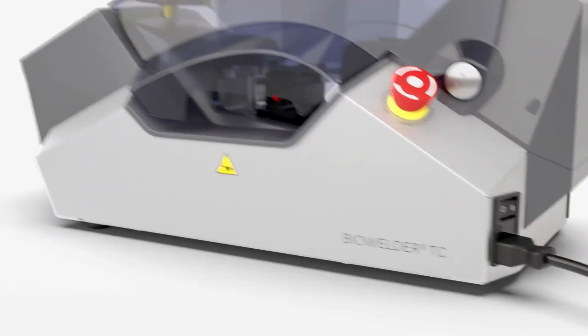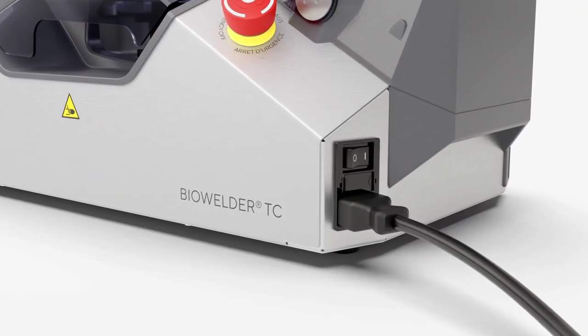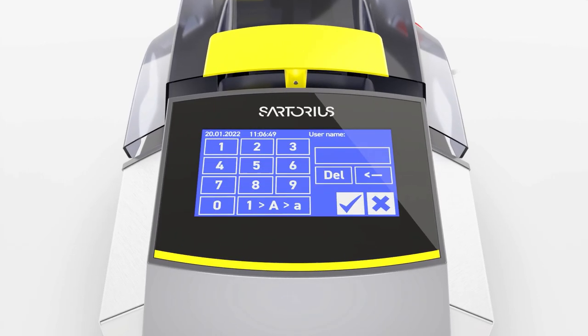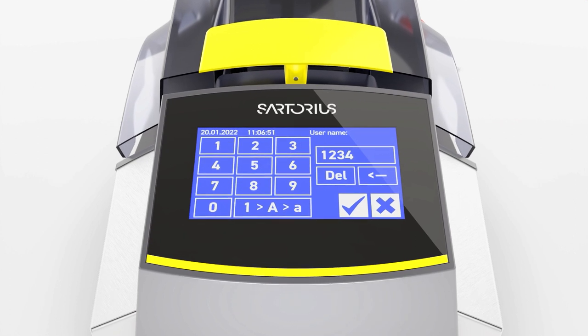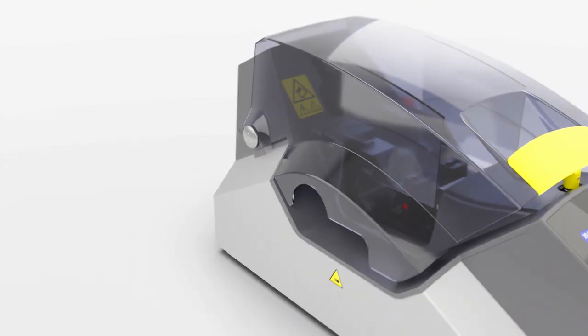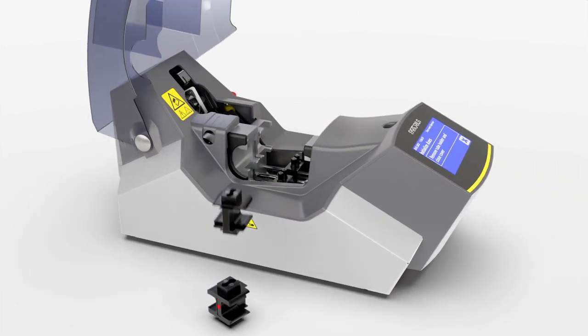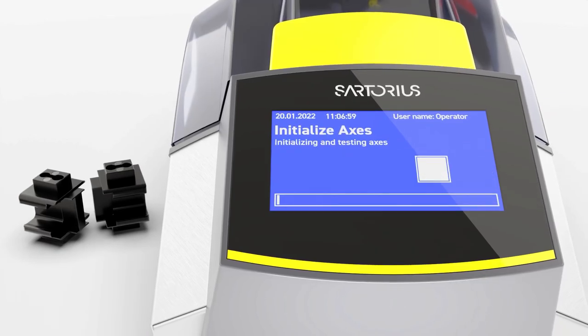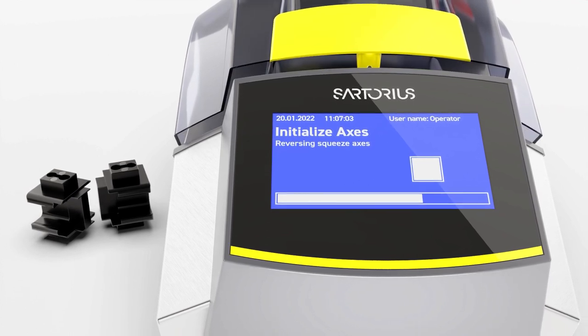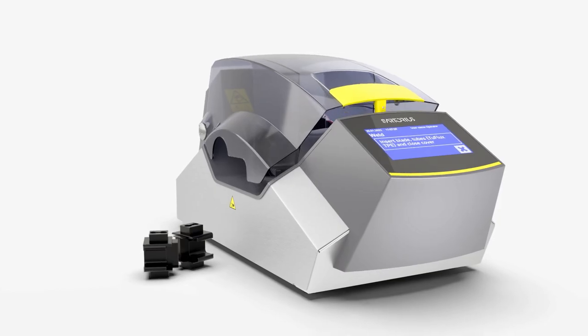To start the Biowelder TC, use the power button on the backside of the system. First, please select User Level and enter your password. Remove the tube holders and close the lid. The system will initialize the axes and the lid will reopen when completed. The system is now ready to use.